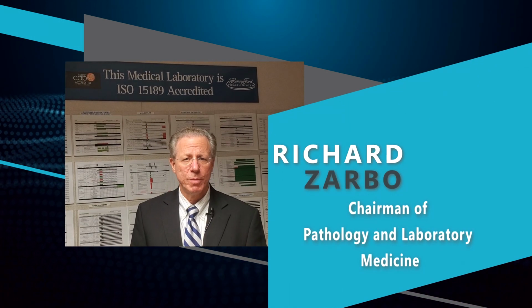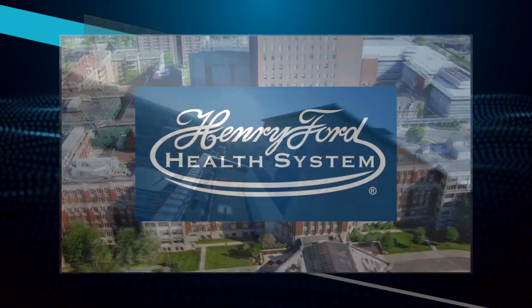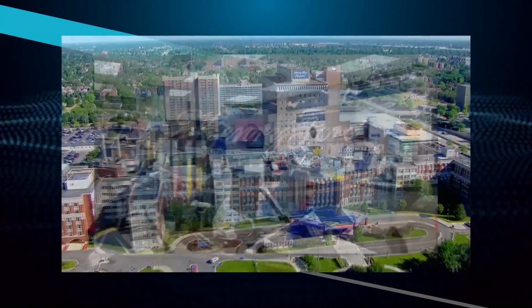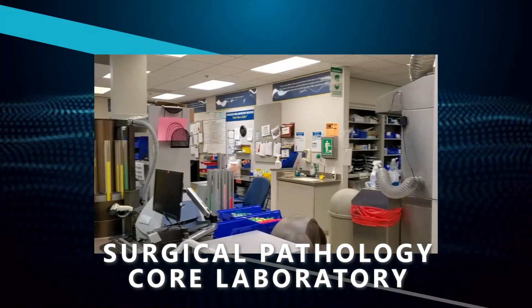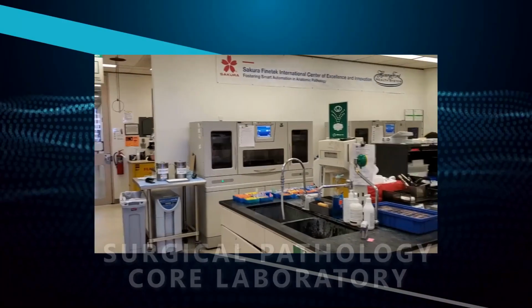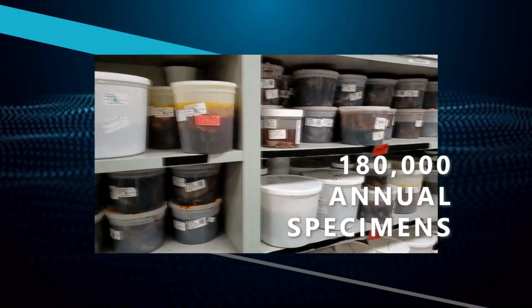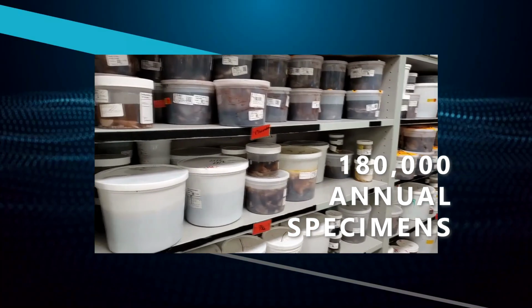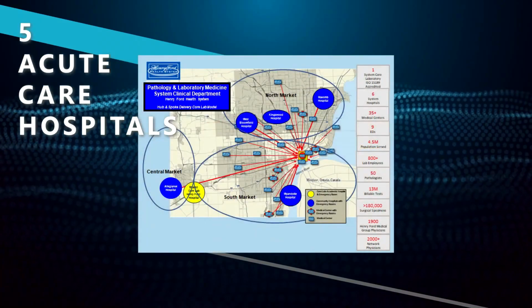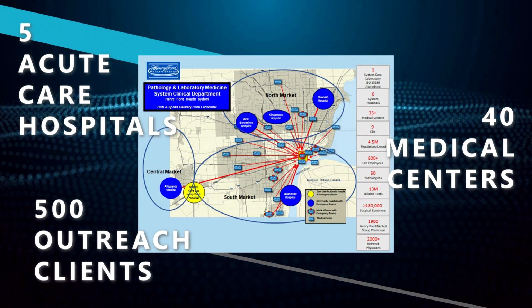Hello, I'm Dr. Richard Zarbo, Chairman of Pathology and Laboratory Medicine in the Henry Ford Health System. We are very pleased to share this video tour of the Surgical Pathology Core Laboratory. It is designed for 24-hour continuous flow operations to process over 180,000 unique specimens annually. These come from our 5 acute care hospitals, 40 medical centers, and 500 outreach clients across Southeast Michigan.